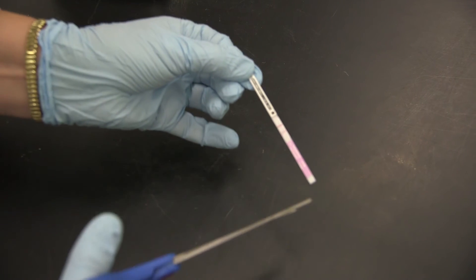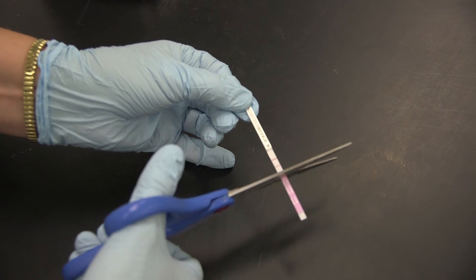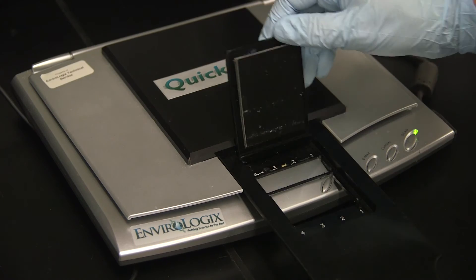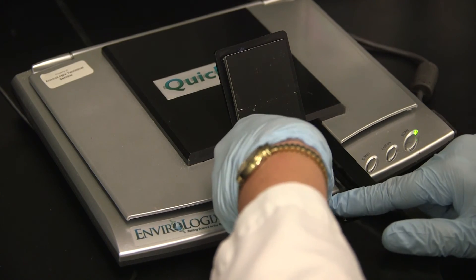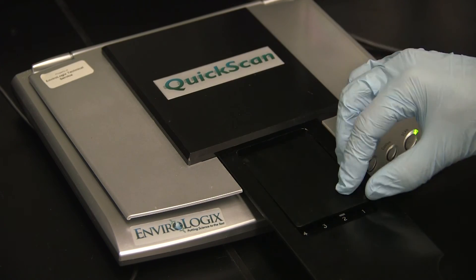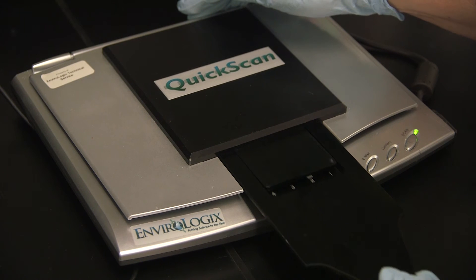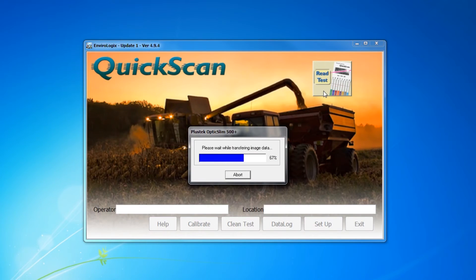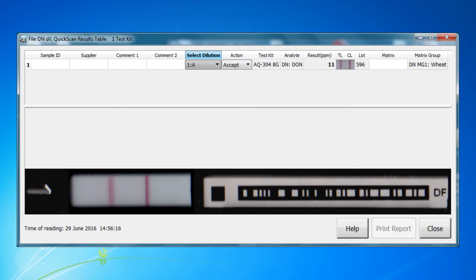Immediately cut off and discard the Aerotape section of the strip and insert the strip into the QuickScan system for quantification. On the QuickScan results screen, choose 1A under the dilution tab drop down menu. The system will calculate and record the Dawn level in the diluted sample.